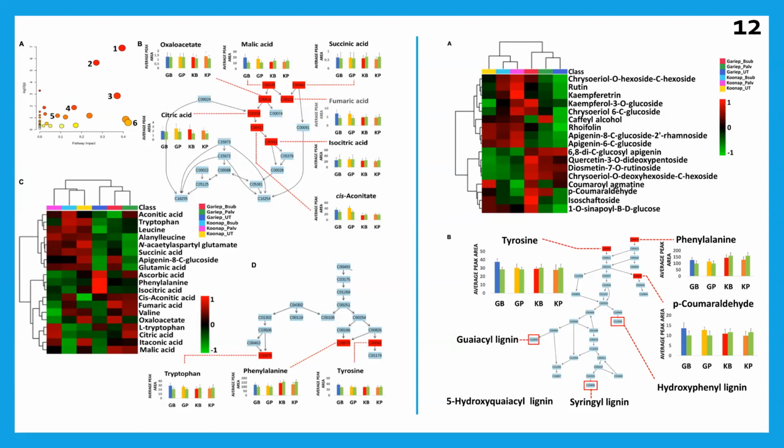So further evaluation of the putatively annotated metabolites revealed potential biomarkers for plant response to PGPR treatment and plant priming. This was where PGPR treatment has impacted the phenylpropanoid pathway.